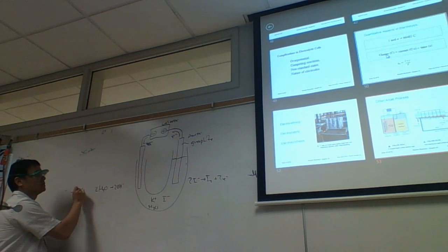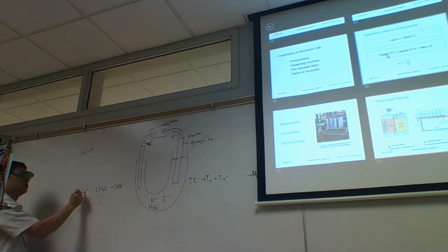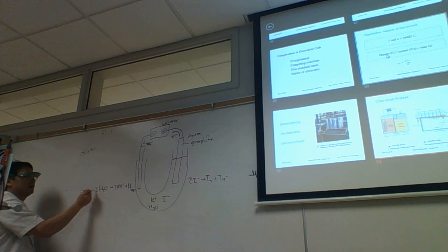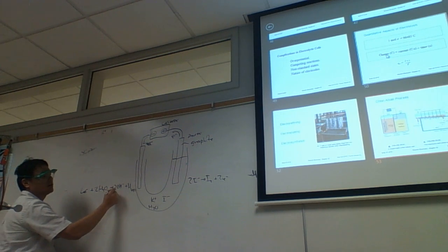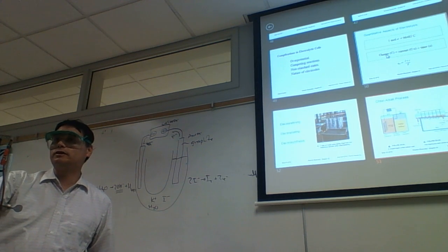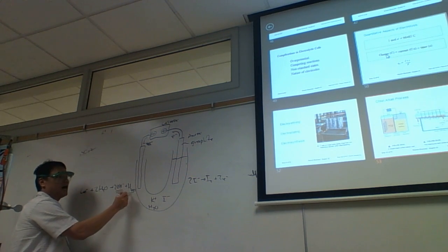We need electrons here, 2 electrons. Two hydroxides, and we're going to have some leftover hydrogen. This leftover will be hydrogen gas. And so H is +1. Now it's going to go to 0. And so we should form at this electrode hydroxide, which we can detect using phenolphthalein. You see hydroxide being produced over here, the pink color, and hydrogen gas.